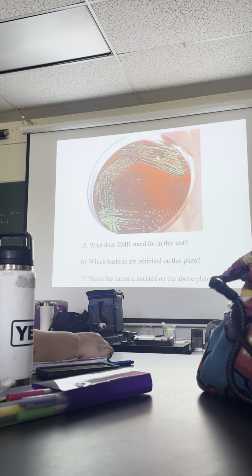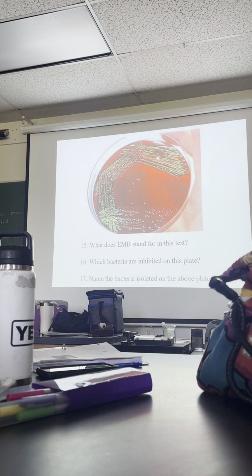negative organisms. Okay? What was the application for this medium? What is it used to test? Fecal contaminants in water. And if you just said water, I'd be really happy. Poop in water. Yeah. And so if you see a metallic green organism growing on EMB, what is it? Beautiful. It is beautiful. Any questions about EMB?